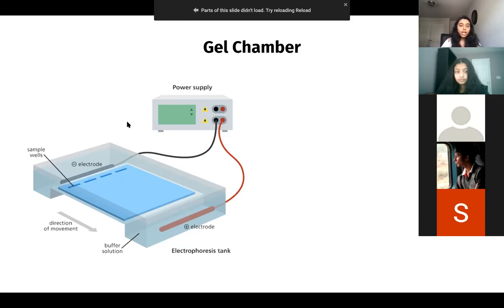And again, you will have different variables that affect the way your gels run. Your voltage and your amperage will change per gel. This really does depend on who you buy your gel box from. They will have different values that you will use.